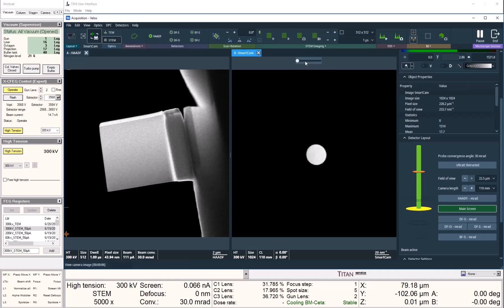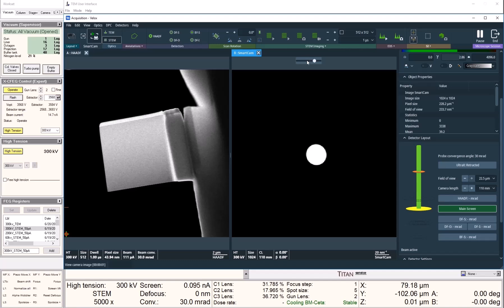Here we have just started our smart cam which sees the fluorescence screen. We can adjust it to be brighter and go to the natural mode to see the Kikuchi lines better.